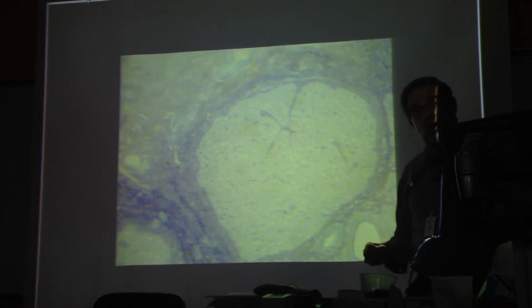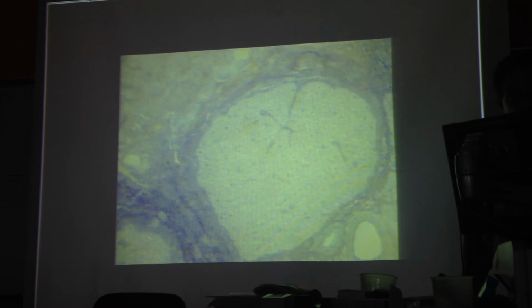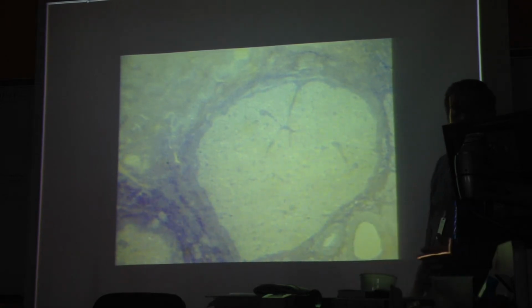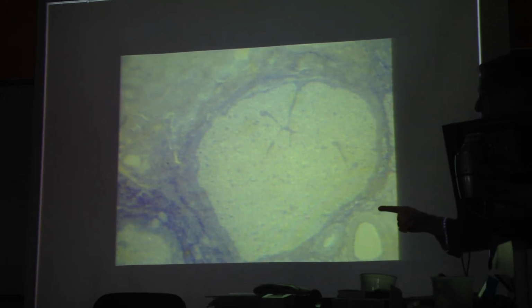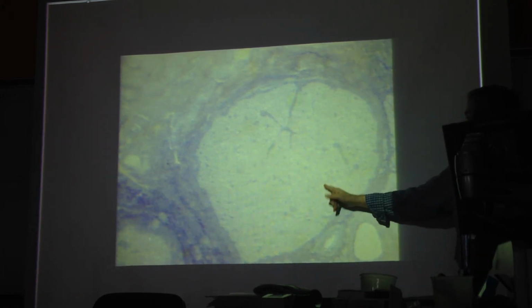So as progesterone levels fall off, the endometrium degenerates and sloughs off, and you get the menstrual flow. So if there's no pregnancy, after about a week and a half or 10 days, this degenerates, and with it the endometrium or uterine lining, and you get the menstrual flow soon after that. If there is pregnancy, the second hormone that maintains this corpus luteum comes into play. And what is that hormone?